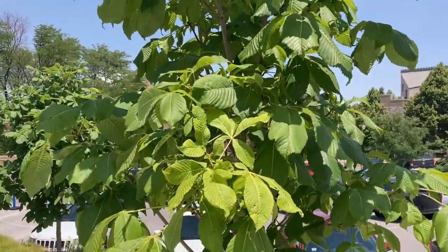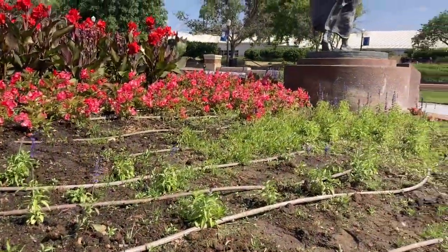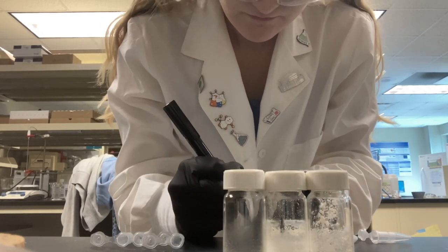Today was supposed to be pretty straightforward. I just needed to characterize some data using mass spectrometry and NMR, also known as nuclear magnetic resonance. These techniques are pretty standard in checking to ensure the product you set out to make was actually synthesized.